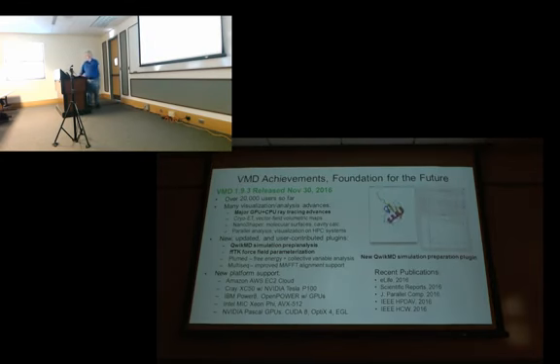The most recent version of VMD was released in November of last year. We have about 20,000 users as of a few weeks ago, so we're getting a lot of people trying it out. Some of the newest features, and I'll highlight these today, and you'll hear about some of them from my colleagues later today and this afternoon. One of the key things that I worked on was new rendering techniques that allow you to produce very high-quality images very quickly using GPU acceleration and the state-of-the-art CPUs.